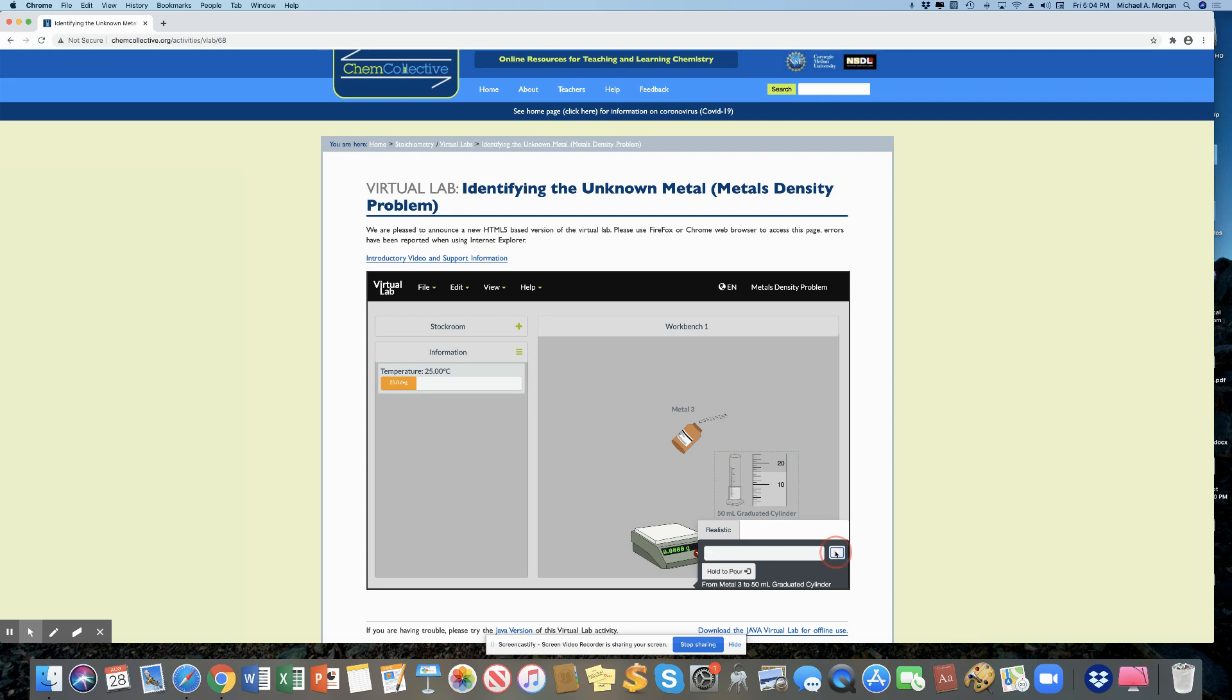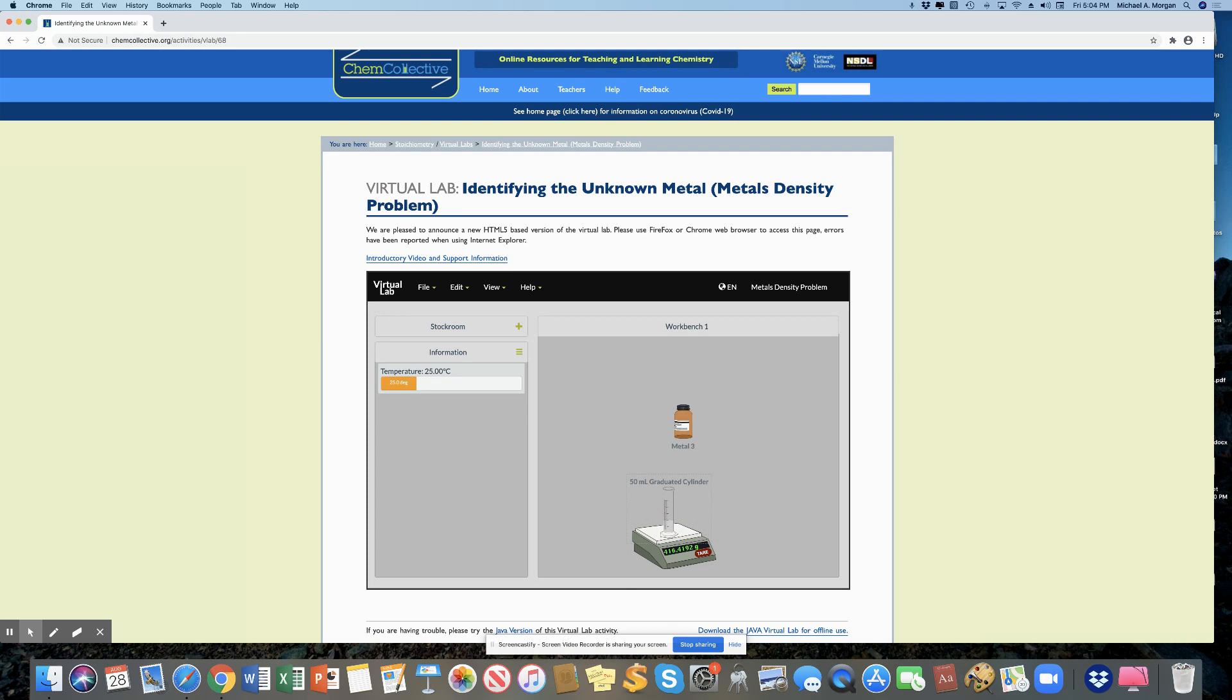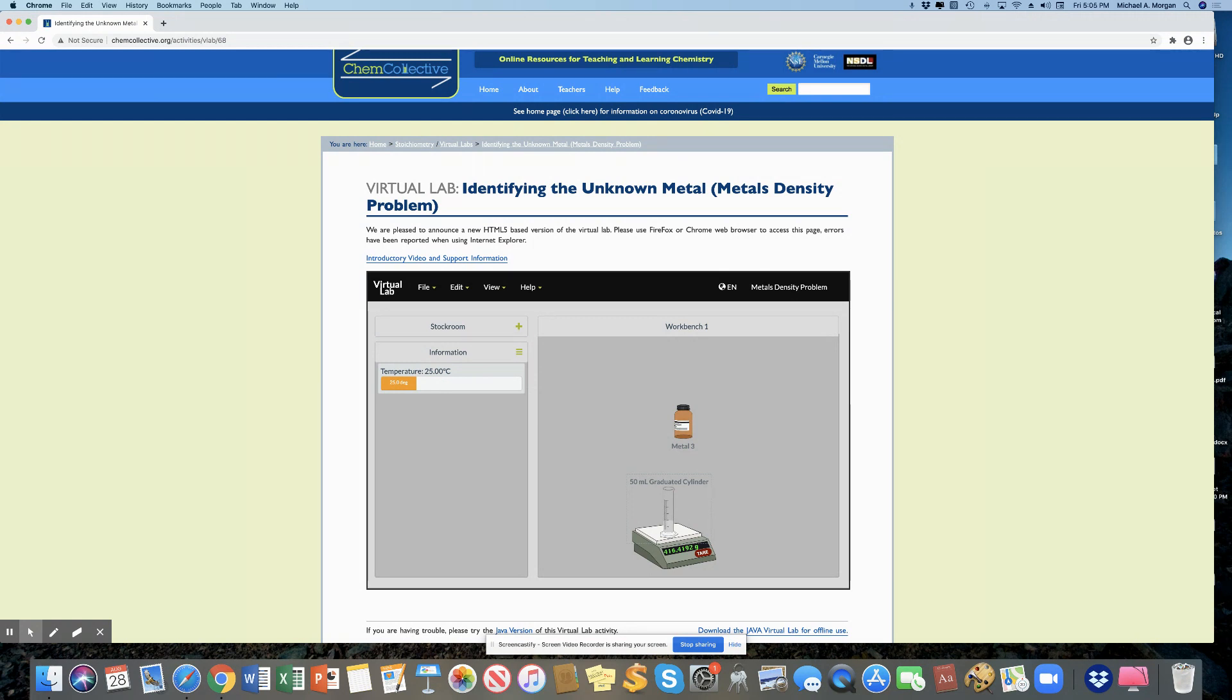Now, I'm going to clear that. I can put this onto the balance. And now I see a mass again. So I'll take the difference between the mass when that cylinder was empty and the mass that it is right now. And that'll tell me the mass of the metal.